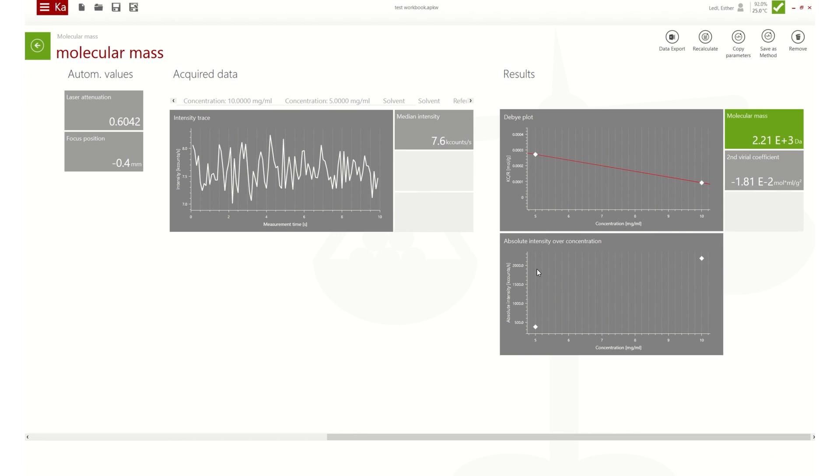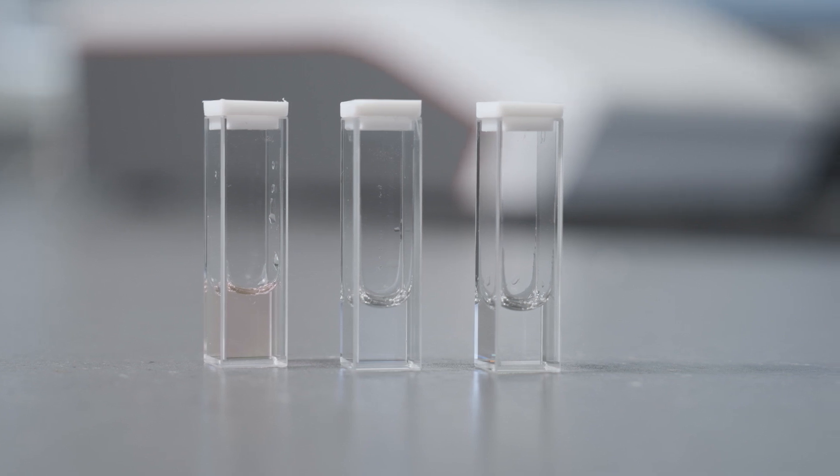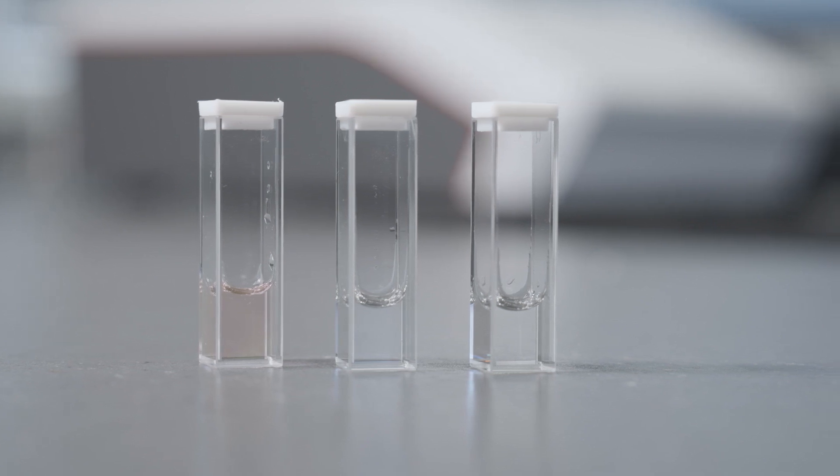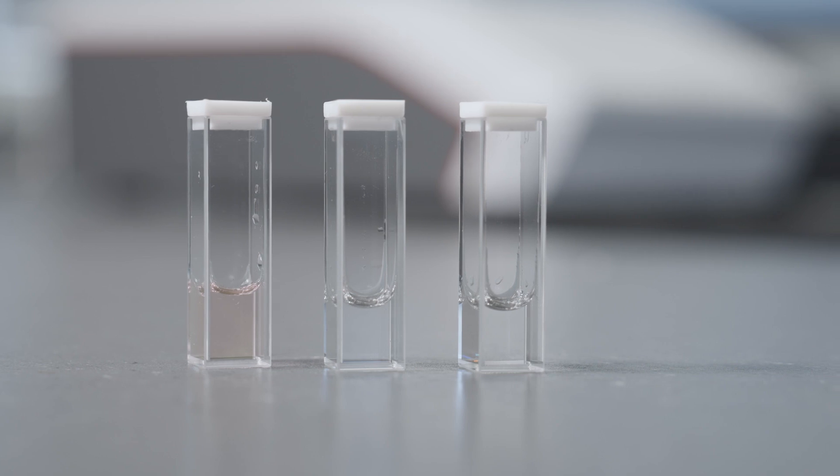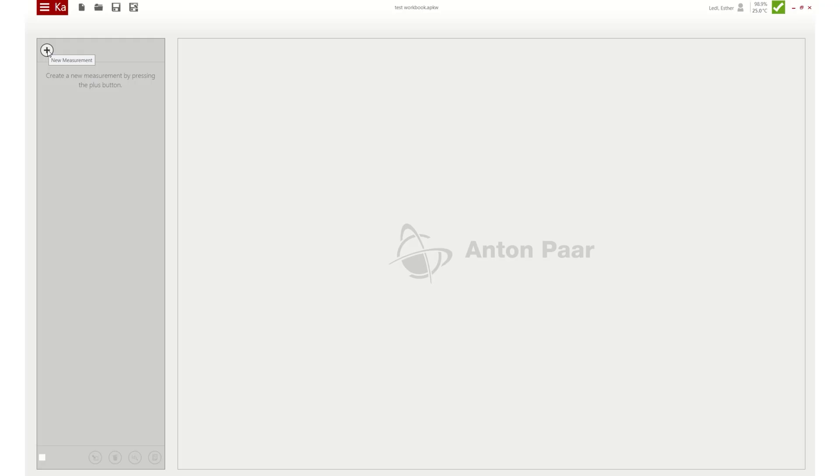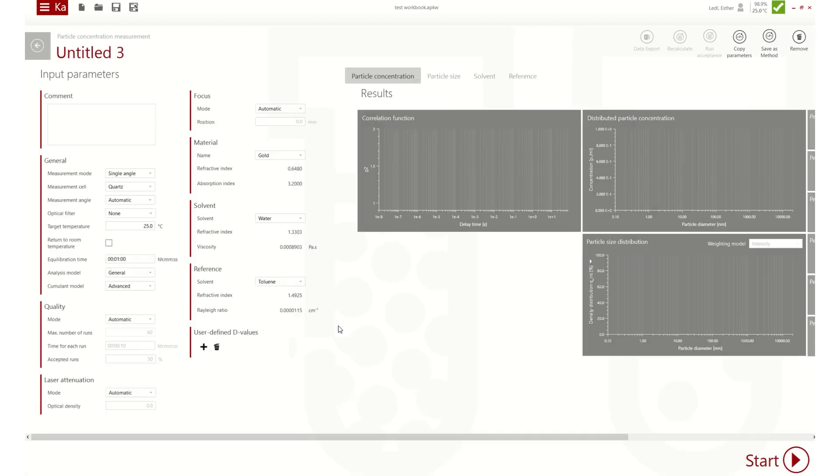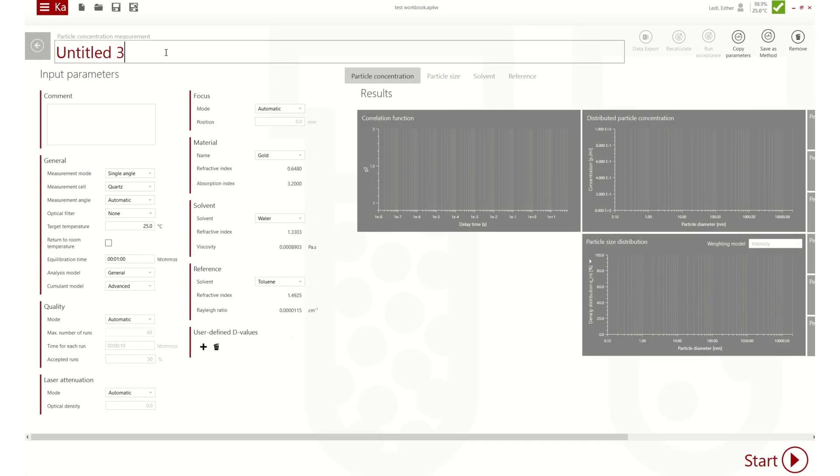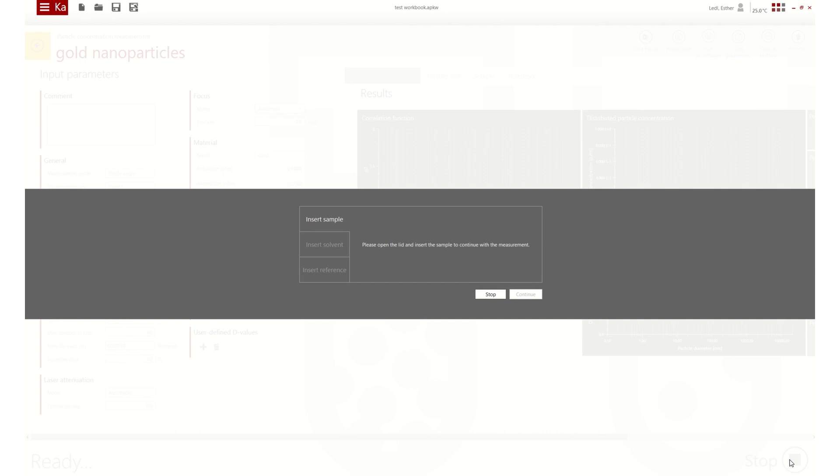A DLS 701 exclusive feature is the measurement of the particle concentration of a sample, PECAN for short. Particle concentration can be measured with single angle only or combined with MAPS. It is necessary to measure the solvent and a known reference after the sample measurement. The result is displayed in particles per milliliter and for up to three main peaks.